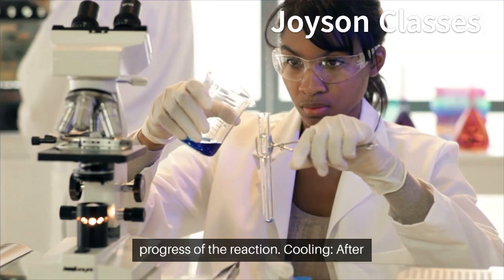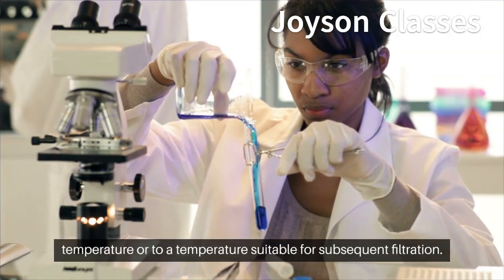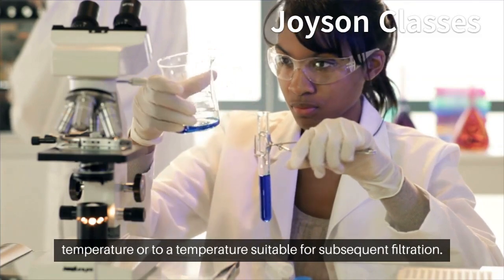7. Cooling. After the digestion period, allow the solution to cool to room temperature or to a temperature suitable for subsequent filtration.